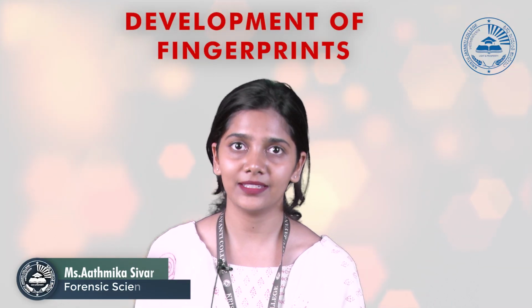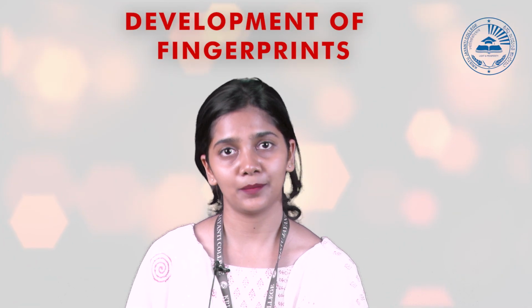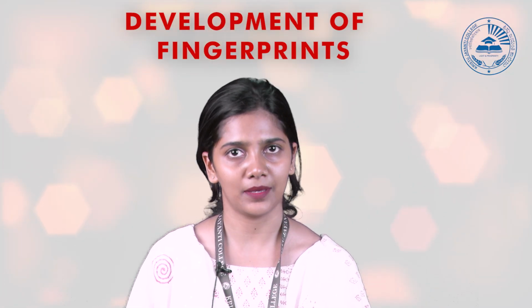The topic that we are going to discuss today is development of latent fingerprints. So we are going to discuss how to develop fingerprints using powder methods and also the iodine fuming method.